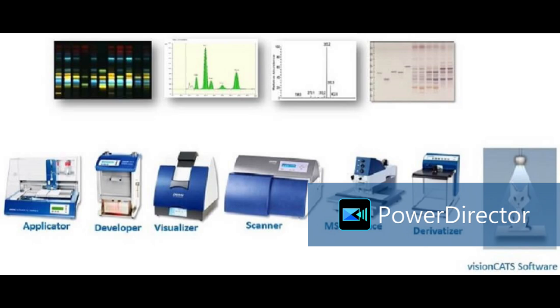After pressing the load button, the stage will come inside. You have to keep the plate inside, or lock it with a magnetic stick. Once you have kept your plate, again click on the load button and close the scanner, and you have to give the command from the software to continue. So it will scan at that particular wavelength.